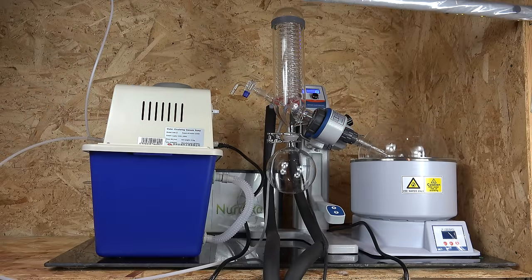Greetings fellow nerds. I have been tremendously fortunate to receive a gift of expensive lab equipment. In particular, I got a complete rotary evaporator system, also known as a rotovap.